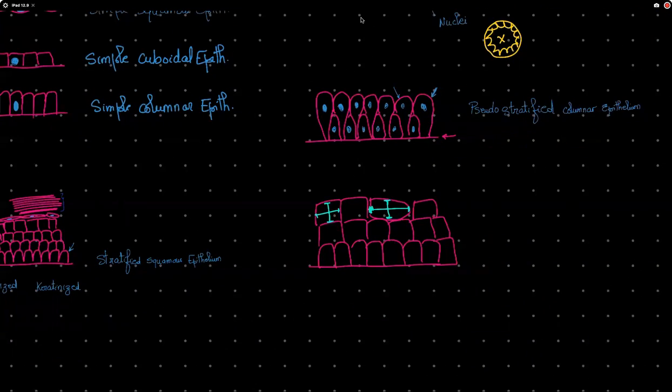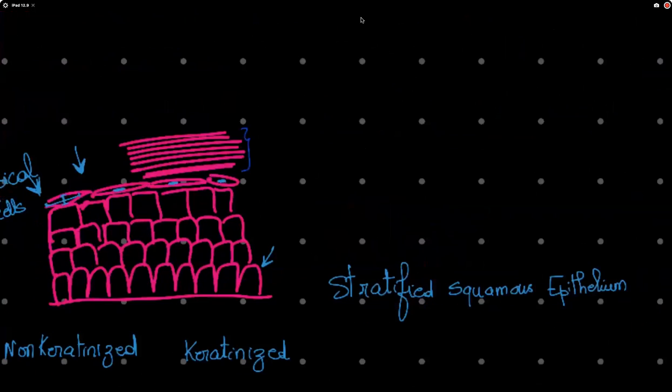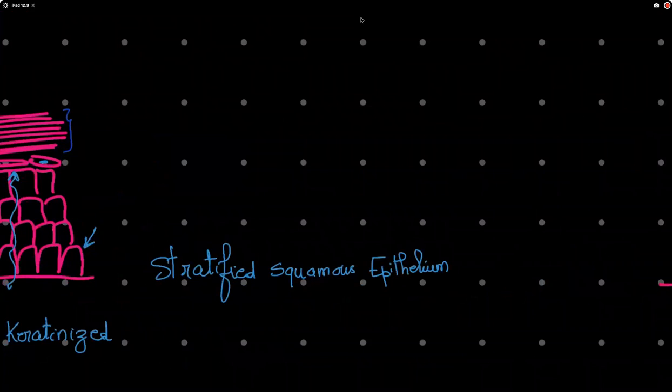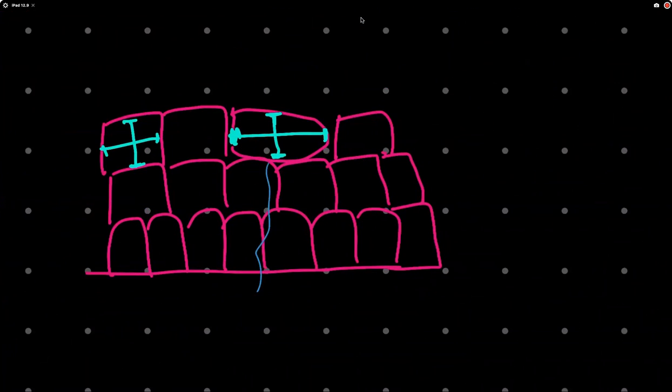But you notice something very important, that those squamous cells are still large compared to those ones. Those are squamous, those are flat, because they got less nutrients, less oxygen by diffusion. But those ones are still large in size, they are just flat shaped. So they didn't lose the oxygen, they didn't lose the nutrients. That's why they are squamous. What happened to them is stretch. So here we're looking at a type of epithelium that has the ability to change the shape of its cells.